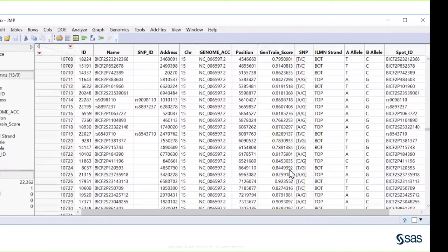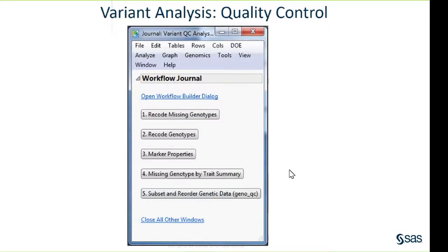We start by looking at how to clean up the data. We need to recode the genotypes, handle missing genotypes that come in with a certain missing code that SAS requires to be different, look at marker properties like distributions of major and minor allele frequencies, look at missingness by trait, and then subset and reorder the data. To recode the missing genotypes, missing values came in as an NC code, which needs to be replaced with a blank for JMP Genomics to run properly.